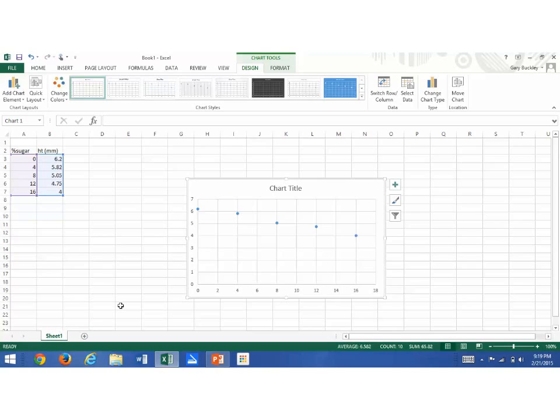You might remember you did this by hand possibly before. It took a little while to do that. We might have done them in the LabQuest before as well. That works out pretty well too. But there's what my chart looks like. Now it's not a very pretty looking chart yet because I don't have a good title on it. I don't have axes labels on it.